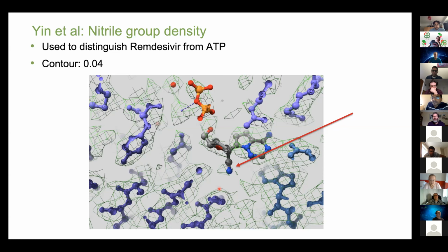Yeah. What do you think about the program to do 3D Fourier shell correlations? What do you mean, 3D Fourier shell? Dmitry Lyumkis does a sort of Fourier shell correlation that's anisotropic. It's different in different directions. Yeah, it sometimes happens, but it depends if it's absolutely lousy in a certain direction. If you have just one direction, then it's really absolutely obvious.